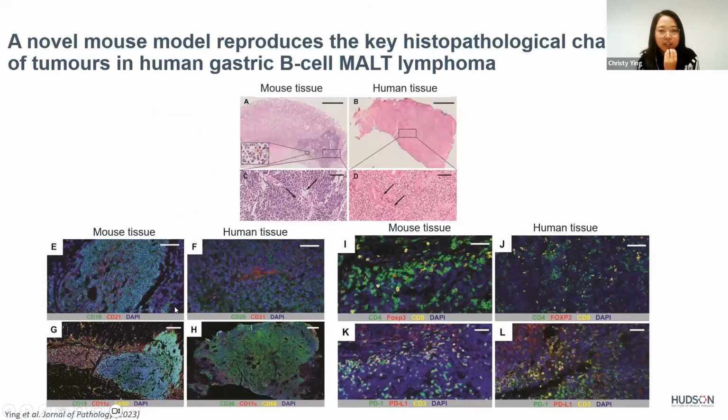As for another story, due to time, I won't go too deep into it, just how I use it. For years, a lot of people have started to use this technology, and most people are using it in human tissues. There are not so many kits available for mouse tissues.